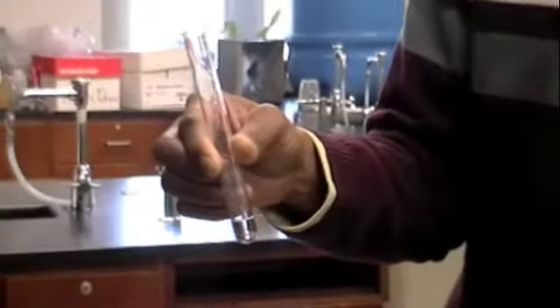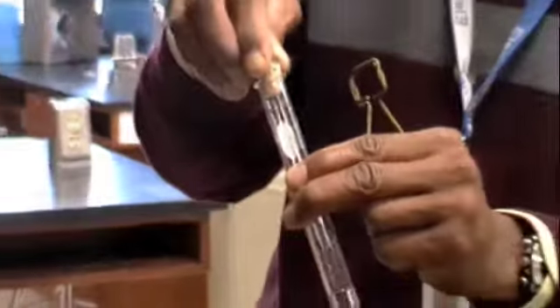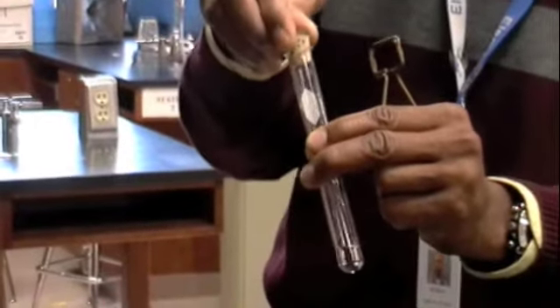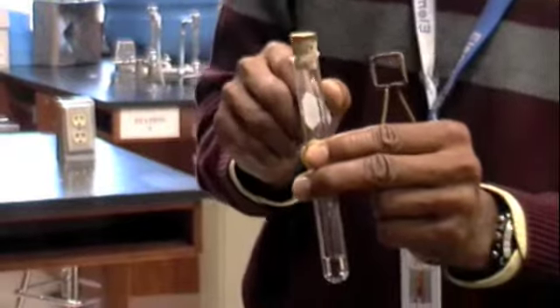Basically what we have is the Bunsen burner setup. It's set to a double cone flame. In this test tube, I have a small amount of water. I'm going to take a cork. I'm going to put it in the top of the test tube. I'm not going to jam it in too much, but just enough so that it's sealed.